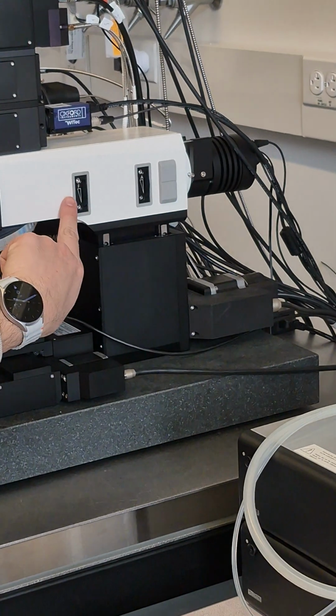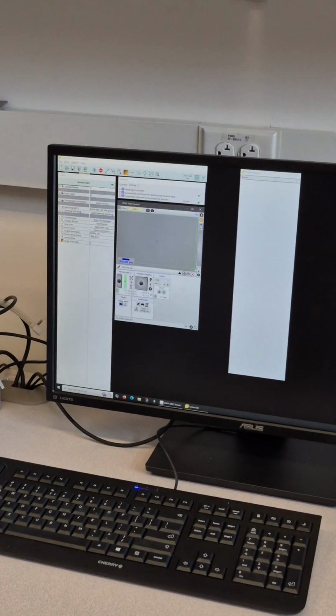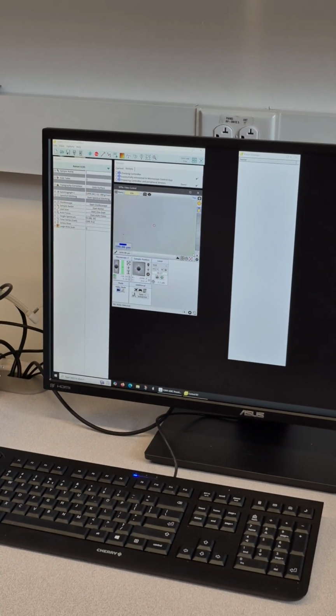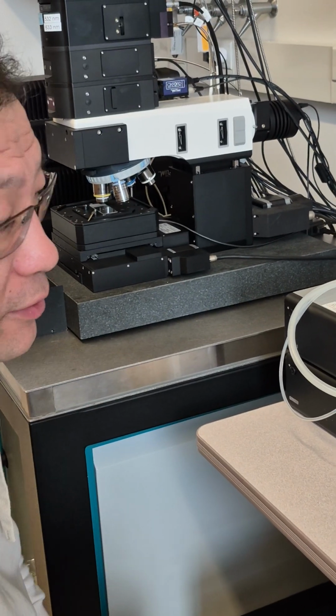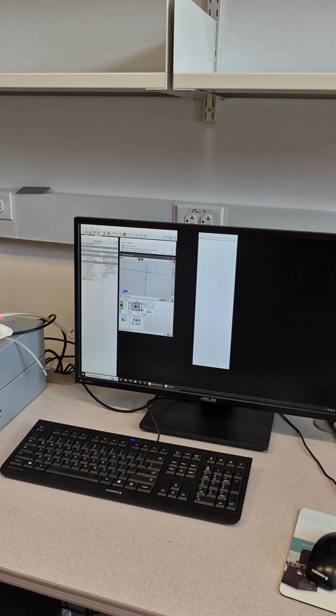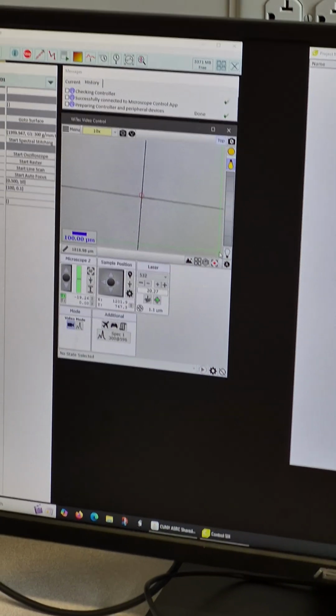Okay. Yeah, you can see the logo. Bigger, smaller. Okay. And auto balance bright. Okay, so now we only use this as a reference to focus on the sample. Are we really focused on the sample? So we can go to the center to check. Yeah, the feature is quite sharp. So which means this works.